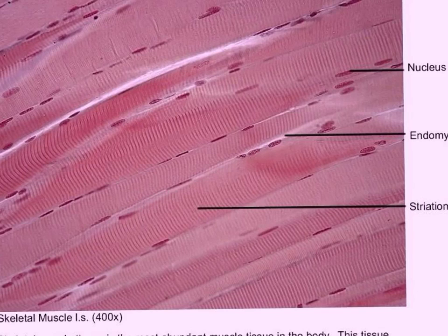As regards the endomysium, you may have a question about its composition. This endomysium is formed of reticular fibers that surround each muscle fiber. And in this endomysium, small blood vessels and small nerves are present. So this is as regards the endomysium.